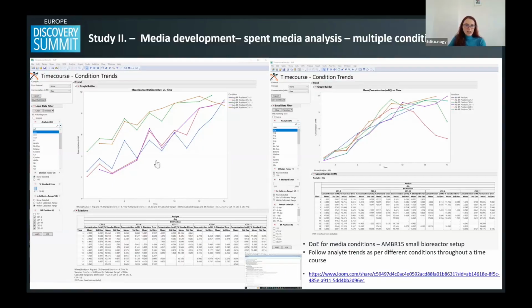When we select one analyte throughout a time course in all conditions we have. So here, there is this bioreactor position with question marks, which was not in the sample label file. So this is a bug in the system. In this case, when checking the data table, the time course components and the name of the sample label were not correctly separated. So this was identified as a bug.